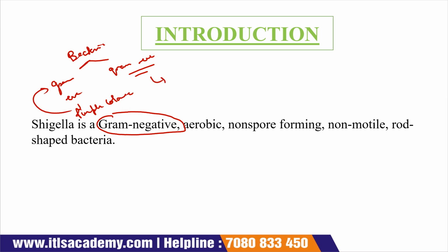And if we get pink colonies, then the bacteria is gram negative. Shigella shows pink colonies when we perform a gram staining under a microscope. That's why it's called a gram negative bacteria: aerobic, non-spore forming, non-motile, rod shaped bacteria.